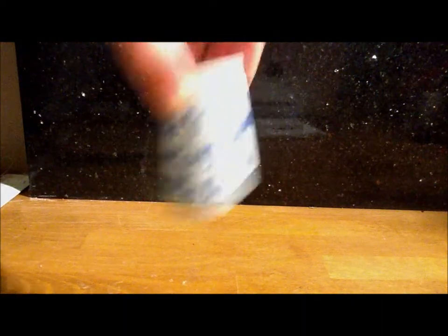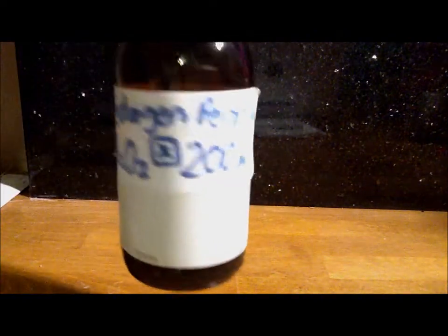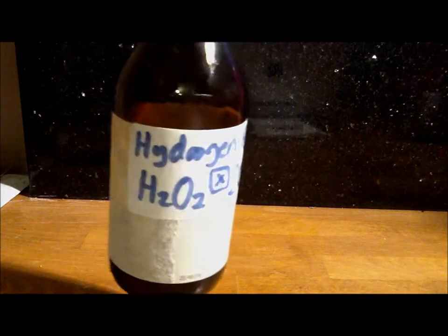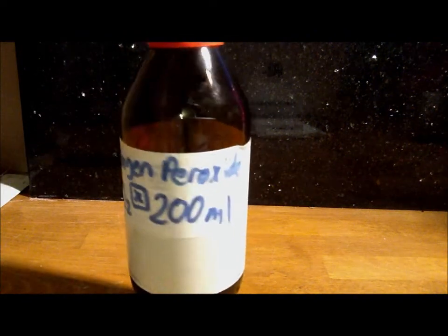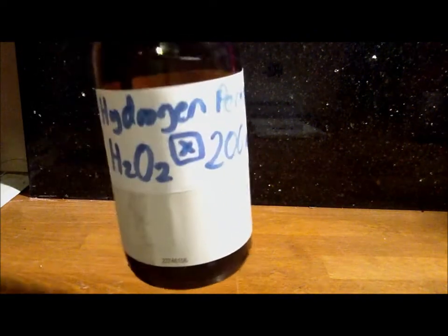Things we need for this are potassium permanganate, purple crystals, hydrogen peroxide - I'm using 6%.